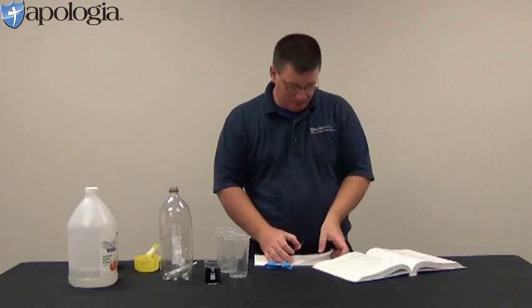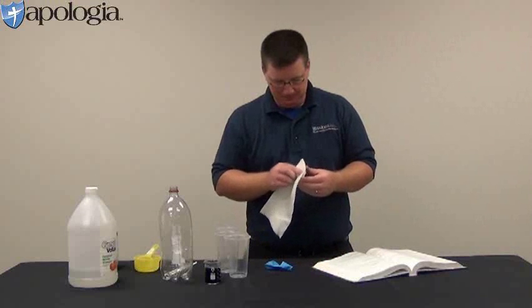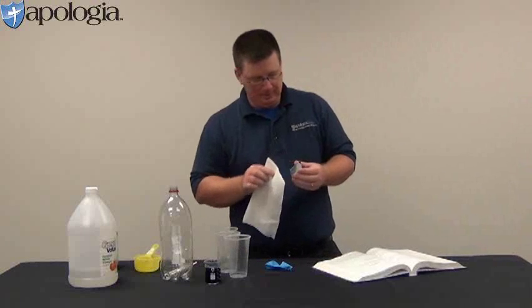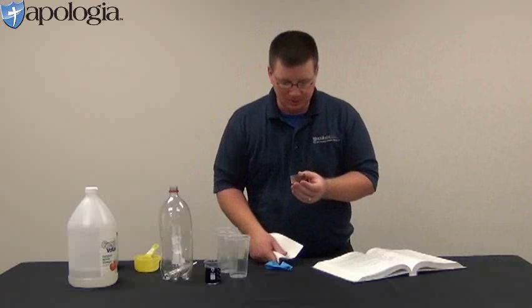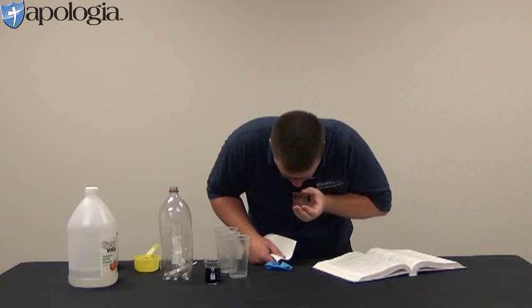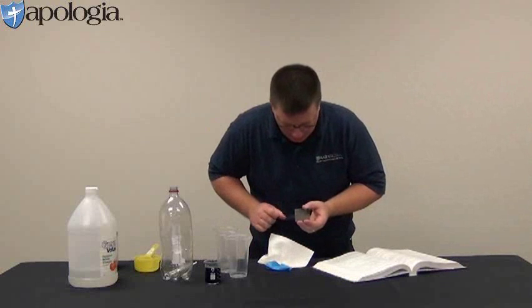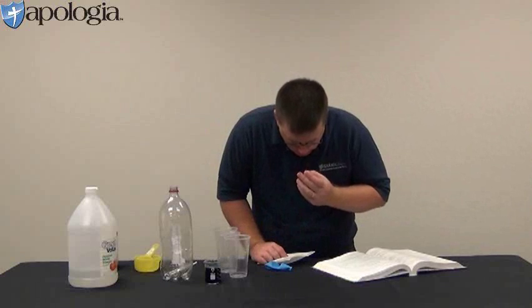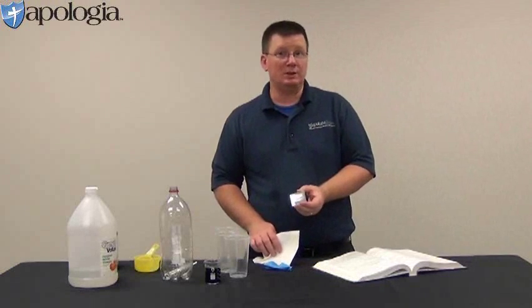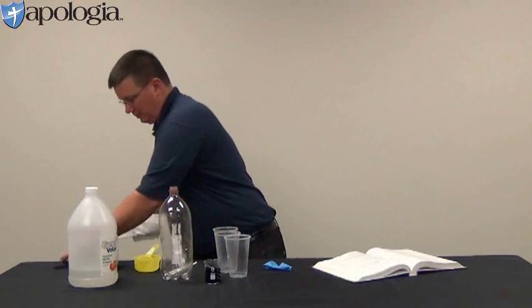Now, step number 7, we are going to clean off this mirror. And now we're going to just put it close to our mouth and blow on it. You should see that it fogs up. That's one of the products of combustion, is water. And so we can see that coming out with the water vapor on the mirror.